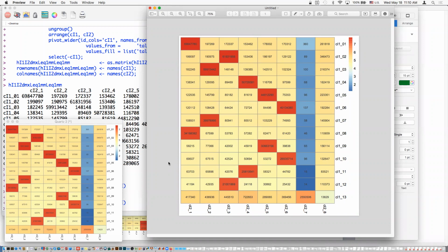And of course, during library prep, all the reagents to attach adapters to samples are active. You can just imagine things can happen there where groups of samples meet each other, chemistry might happen, or whatever. I mean, maybe some get the wrong adapters on, because maybe they weren't perfectly clean before you mix them together.